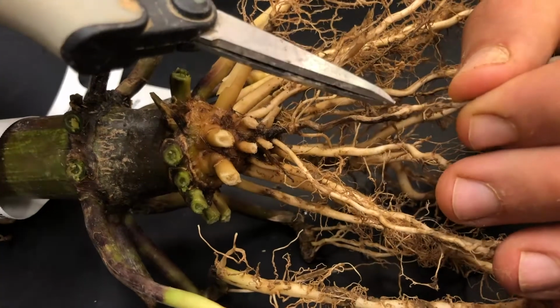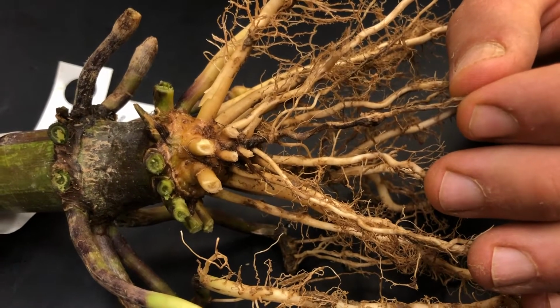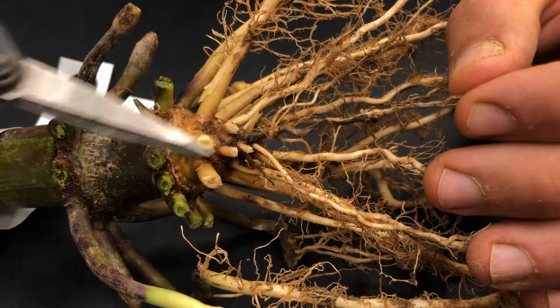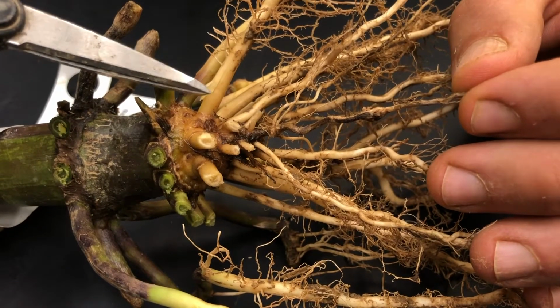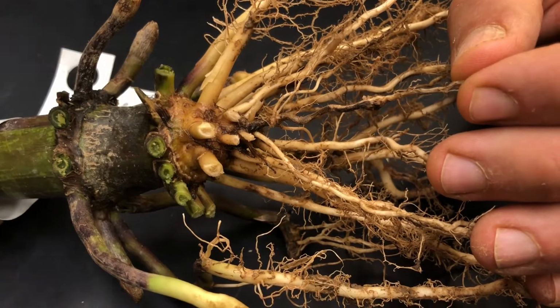Here we can see the mesocotyl, where the seed initially existed, and the primary root which emerged from that germinating seed. The rest of the subterranean roots you see in this crown are referred to as nodal roots, and upon closer examination, we can see that they are organized into distinct rings or whorls.